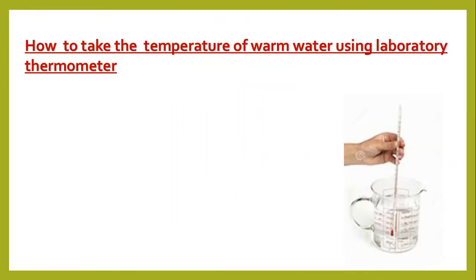Now let's start with our main lesson. How to take the temperature of warm water using laboratory thermometer. So as you can see in the picture, the man holding the thermometer is measuring the temperature of warm water in a glass cup.